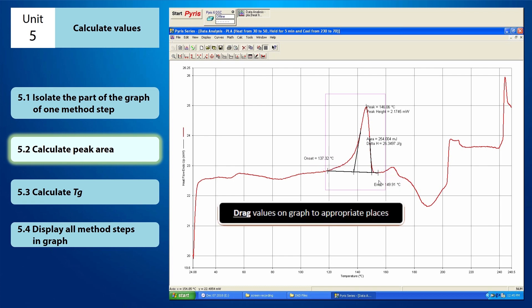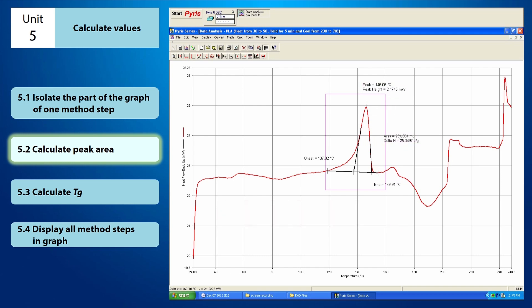You can drag the values to the appropriate places. Now your calculation for the peak area is complete.